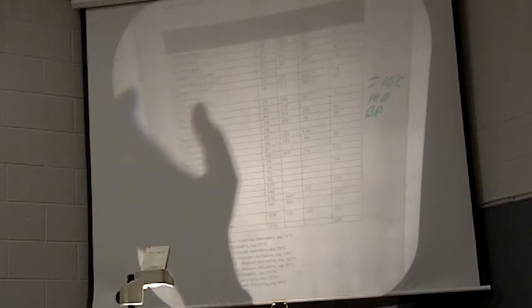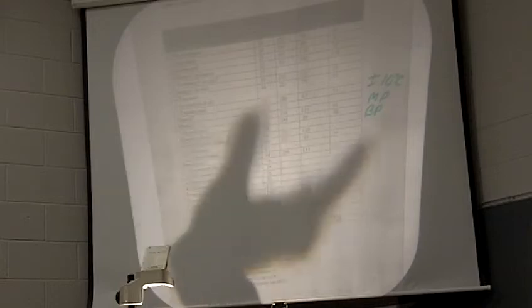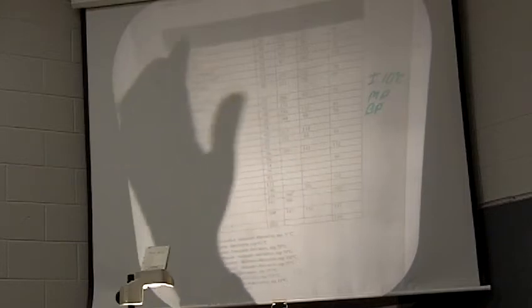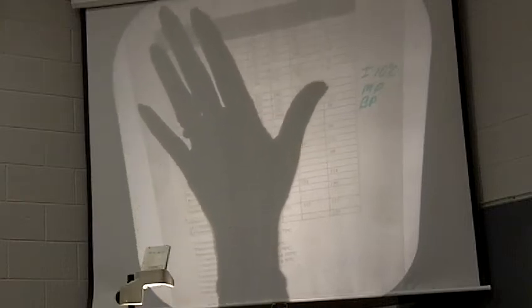So just make sure when you go to look at this information, you need melting point and boiling point. You need to know the chemical class, and your chemical characterization test and your IR spectrum should go together. Solubility test should also help with that, but the chemical characterization test or the flame test and the IR spectrum should go together. All right, everyone good with this?